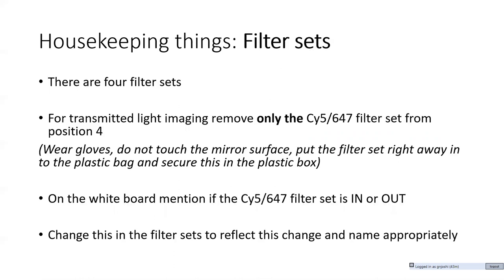A few other things, we have got 4 filter sets. As I talked to you earlier, if you want to use transmitted light imaging, you will only remove the 4th filter set, which is the Cy5 or 647. And again, when you are removing the filter set, wear gloves, do not touch the mirror surface on the filter set. Once you touch that, it's extremely difficult to clean. That will affect the light intensity and screw up a lot of things for everybody.